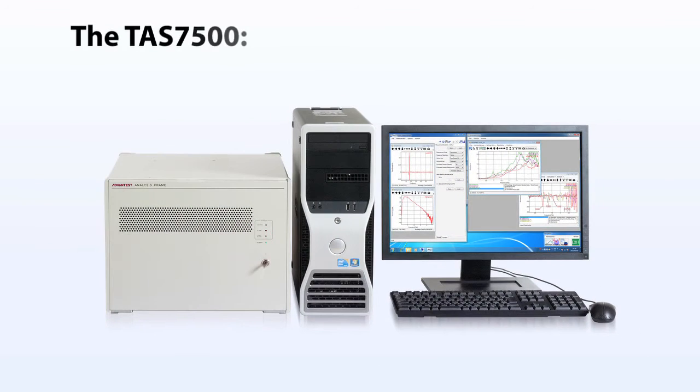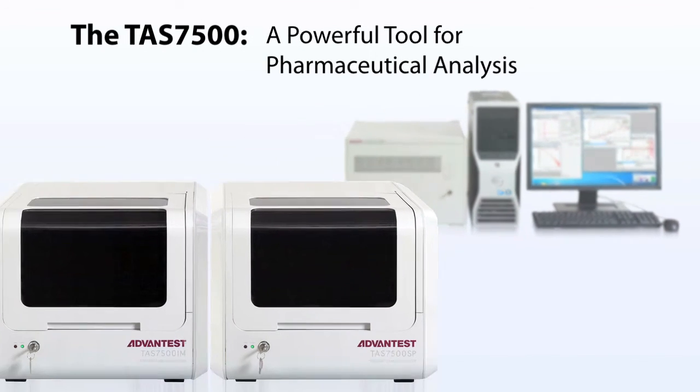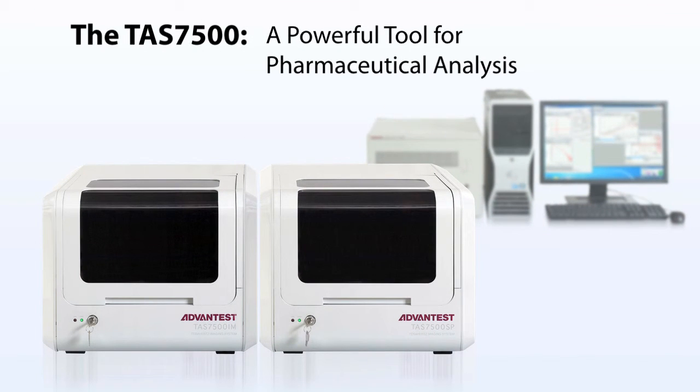Advantest TAS7500 terahertz system provides the means to facilitate solid form selection, speed the development of pharmaceutical processes, and assure the quality of solid dosage forms.